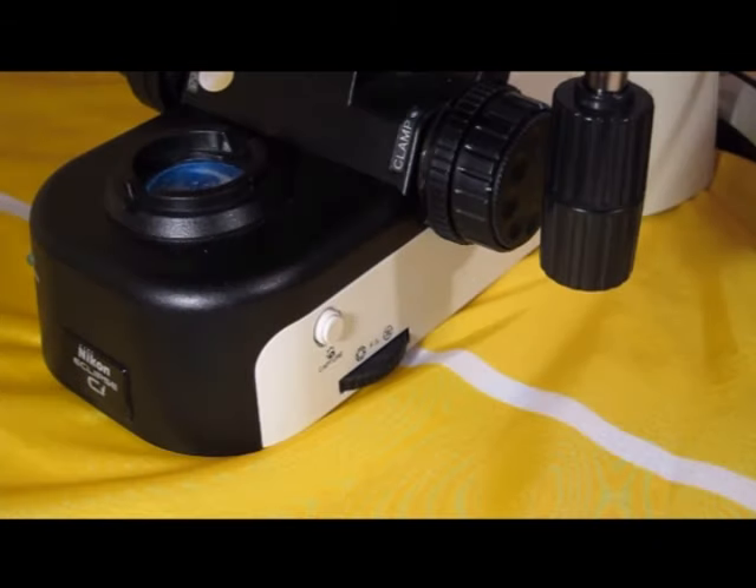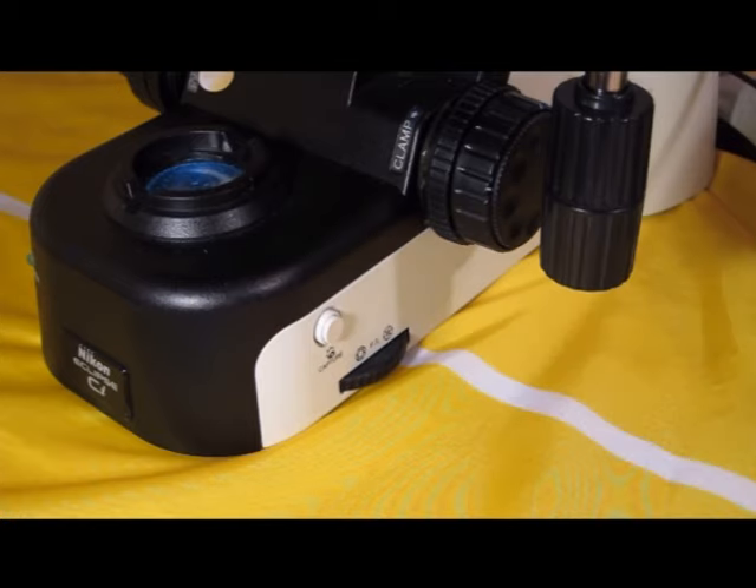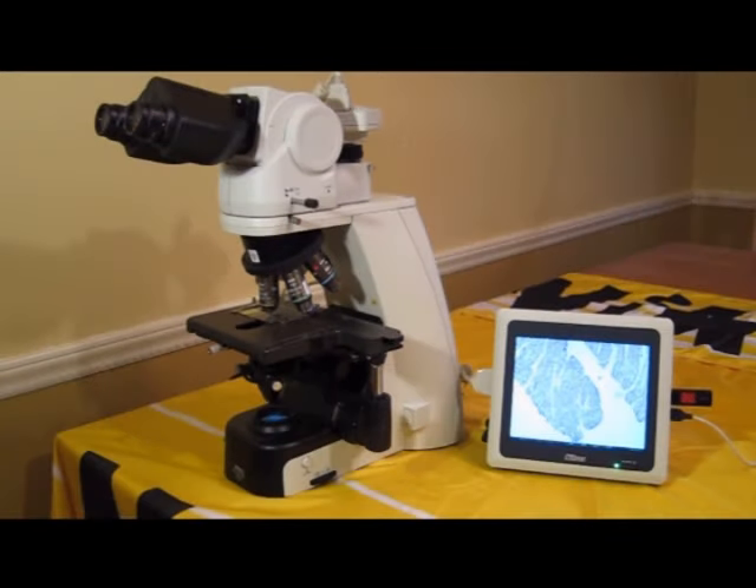For a smoother workflow, you can take advantage of the conveniently located capture button on the CIL microscope. I hope this brief overview of the Nikon DS-FI2 camera and DS-L3 controller was helpful. Next time, we'll explore more features of the L3, such as the dual window, measurements, and annotations.